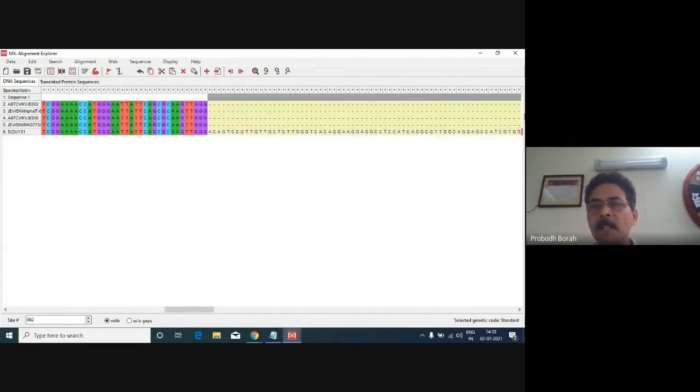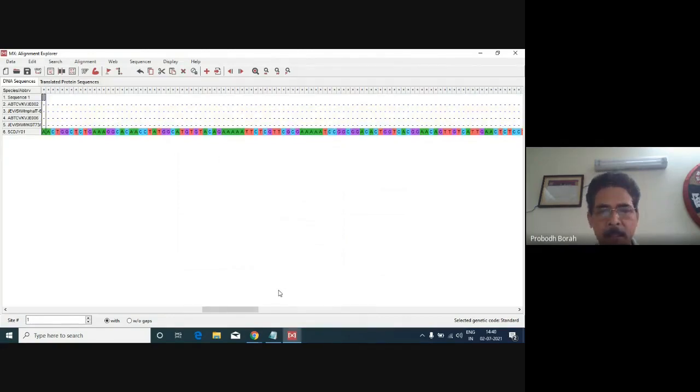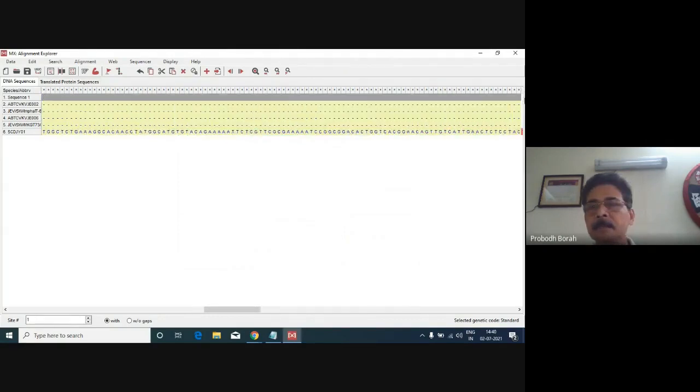I'll try to do it faster so that we can complete it within a short time. So let me delete it once again, then again come back to the sequence, then click here, then delete it.